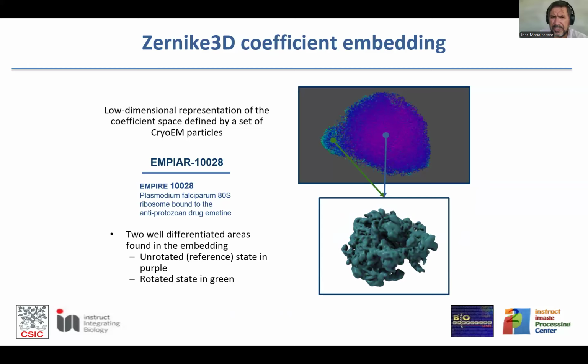So with the case of the ribosome, that is a nice big case, you see this rotation of the 40S on the 60S coming from 2 points of the landscape. Each of these points is an image. And what we are seeing is that we can map the conformational space obtained through the images of that specimen, we have this reduced representation. We can explore this representation interactively. That's what we want. And we get information about the flexibility.